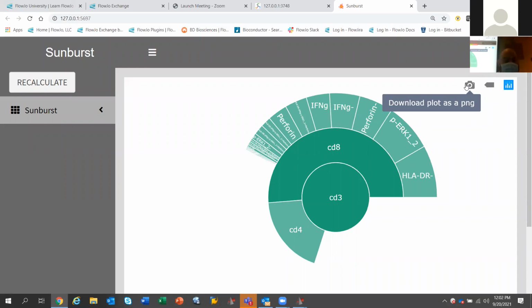All right, so that's all I have today for your basic analysis. And in the afternoon, we'll come back and we'll go over high dimensional data and how to do analyses incorporating non-conventional into conventional parameters.